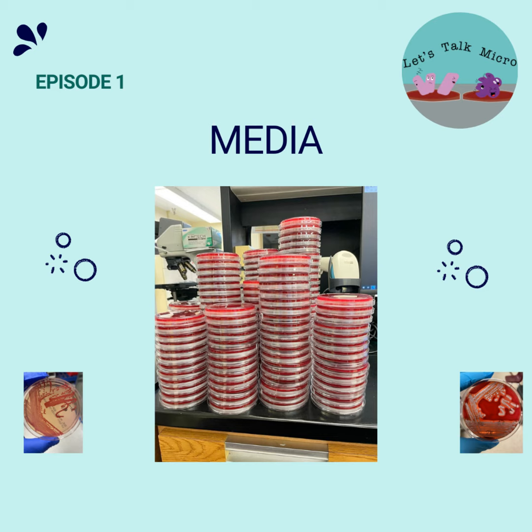Normally, the media is classified based on its functions and what it contains. And this is where we get a little technical. In bacteriology, we have four categories of media. We have enriched media, which has specific nutrients required for certain pathogens. A great example is Lim broth, which we use for the recovery of group B strep. We have nutritive media, which contains nutrients that support growth of most organisms. So basically, it grows pretty much everything.